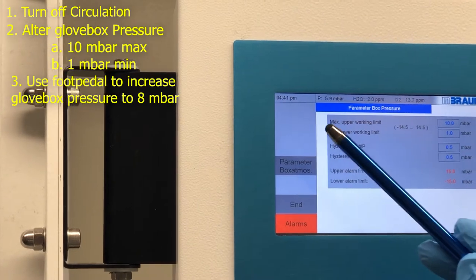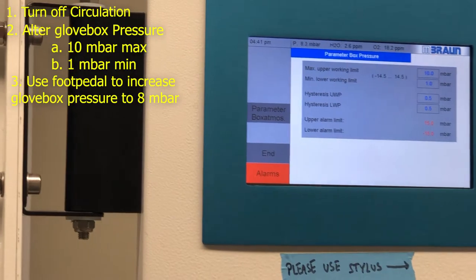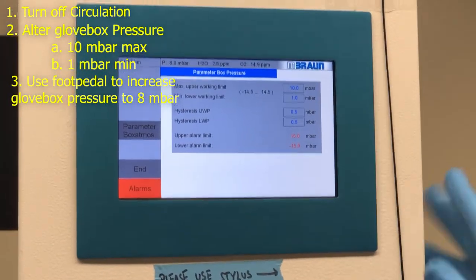Don't want to overshoot because I have to vacuum off. So we're going to, there we go. 8.4, that's fine. 8.3, 8.2, right? You can see it's at about 8 right now. So that's what we want.